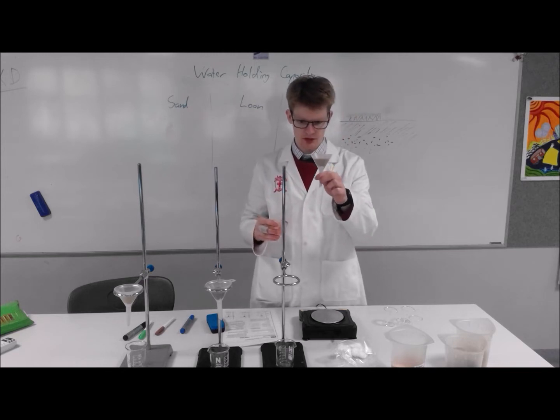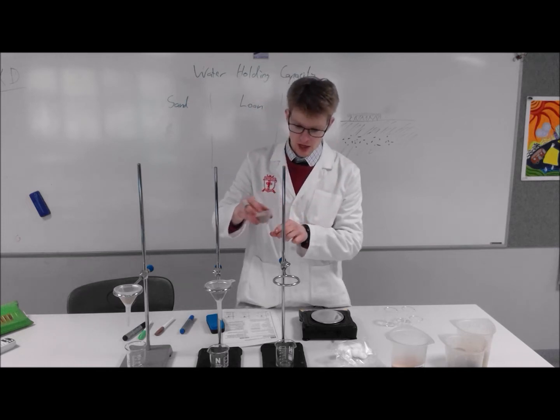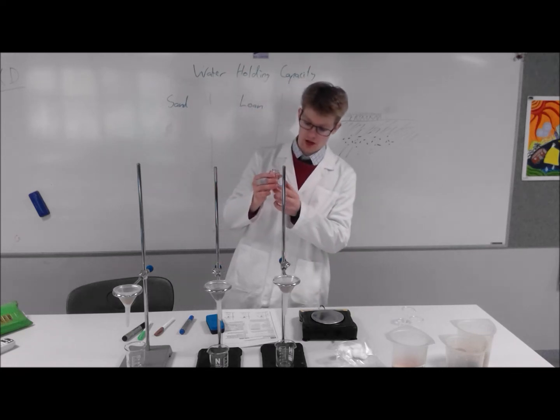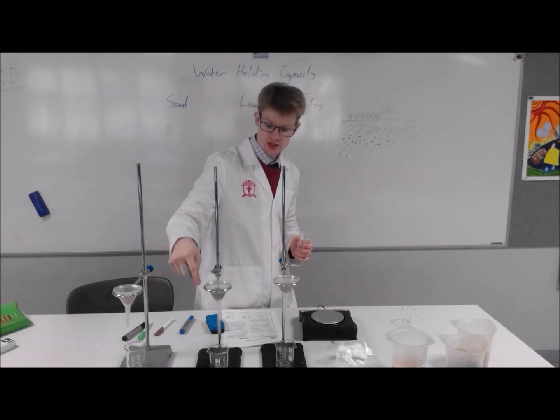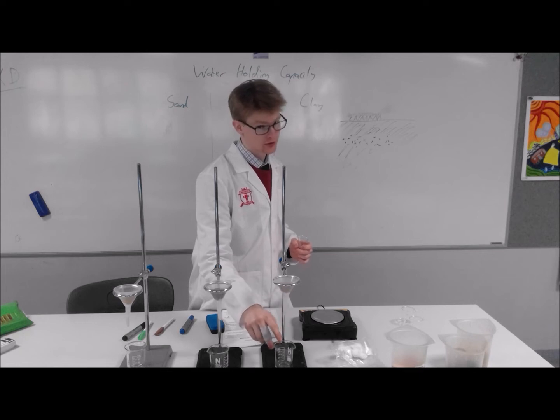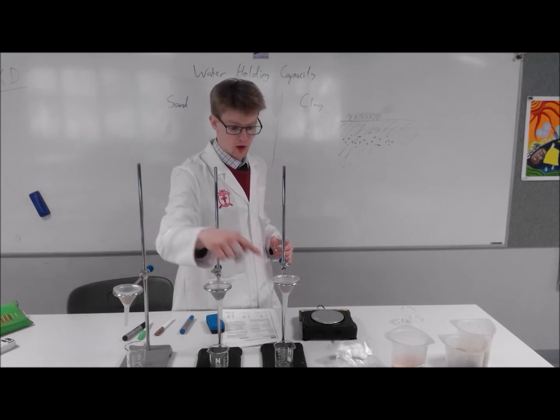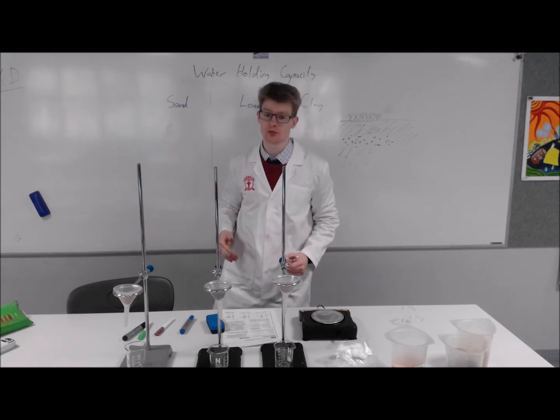I can roughly fill up the funnel without having the clay fall through. Now, what do you think would happen if I got a beaker and filled it with 20 mils of water and poured 20 mils of water into each of these funnels? Would we see any water drip through? Well, that's what I want you to hypothesize. I want you to make a prediction as to which ones we're going to see water drip through and which ones won't, and how much water we're probably going to see drip through each of them.